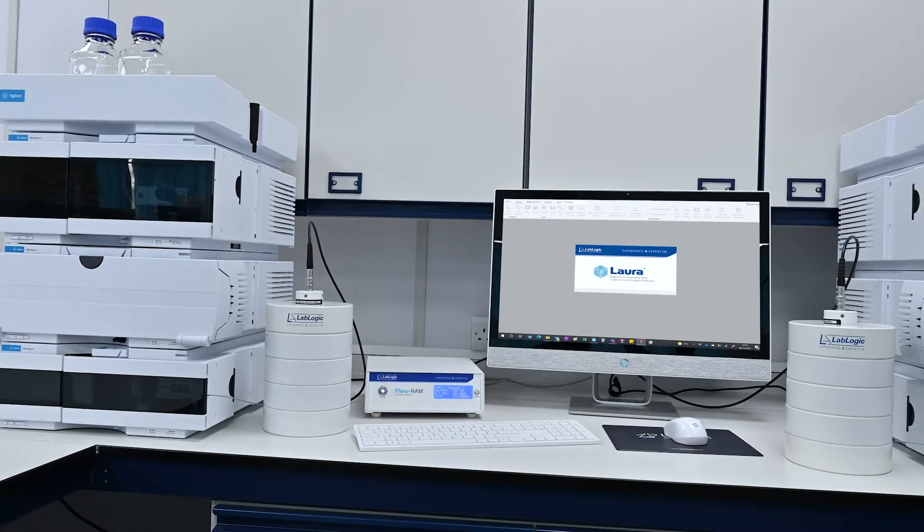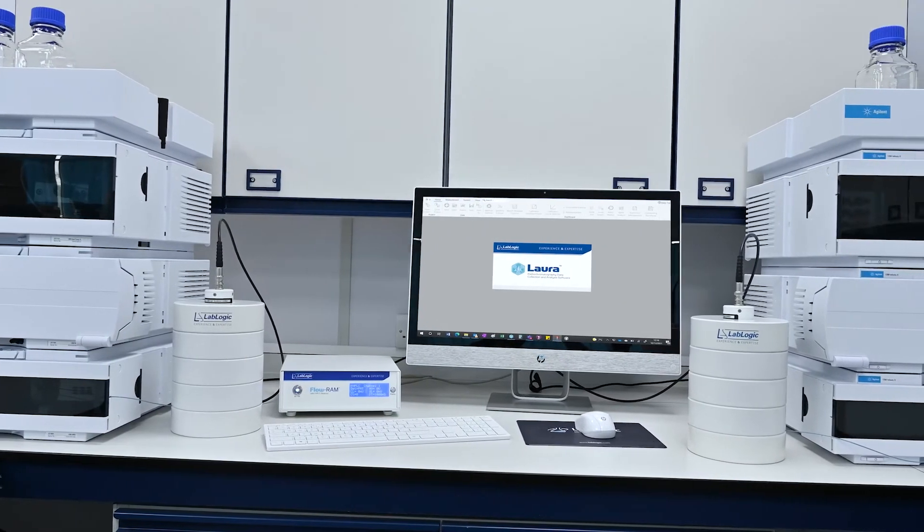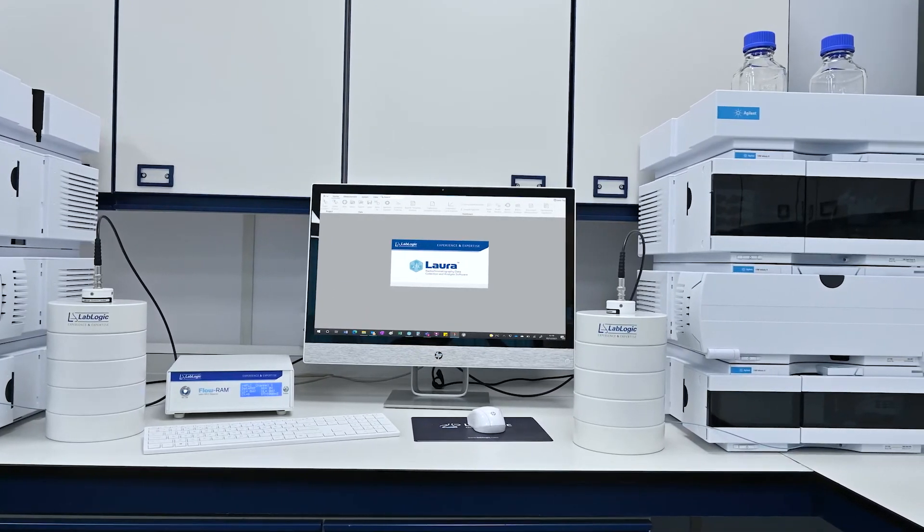The dual FlowRamp allows one electronic box to be coupled to two separate HPLC systems, which is great for labs with limited space. The two detectors will work both simultaneously and independently of each other.